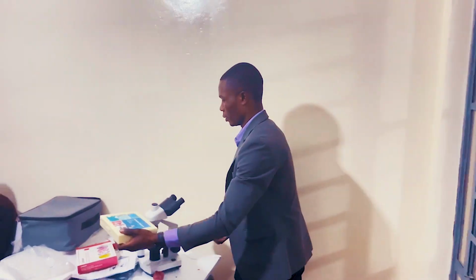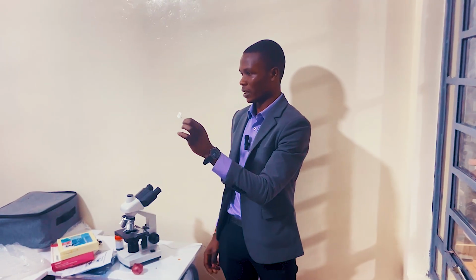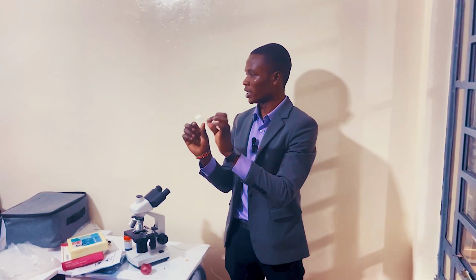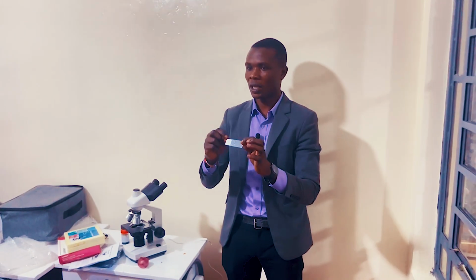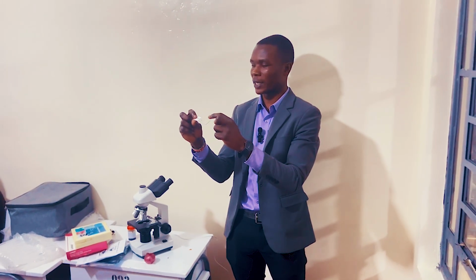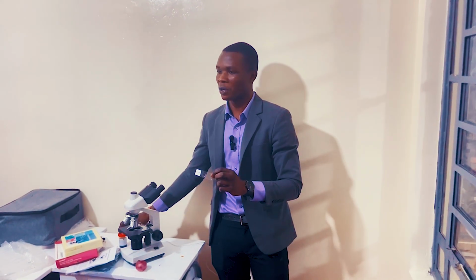So after you have cut your specimen, you are going to put it on a slide like this. When you put it here, this is where you are going to stain it from. You cannot stain first. You put the thin layer you have cut here, then you stain it by adding drops of iodine solution.